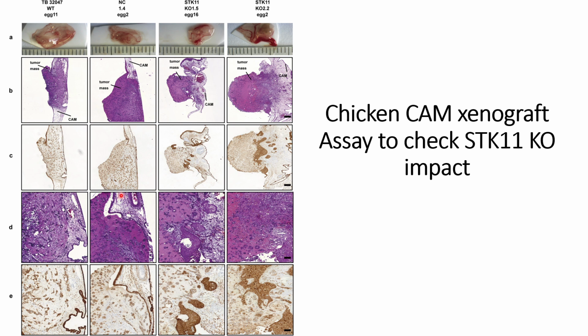And this panel D is the zoomed-in image of panel B, where we can see that the CAMs are slightly transparent in this region.